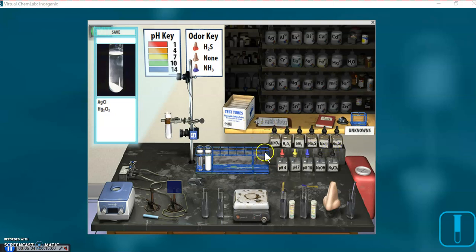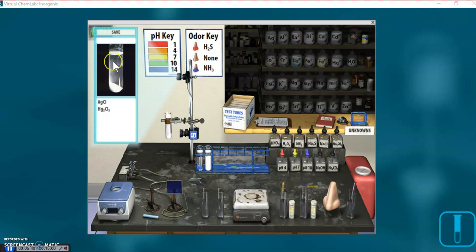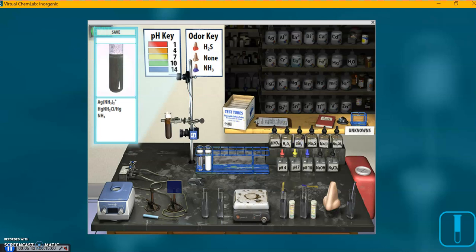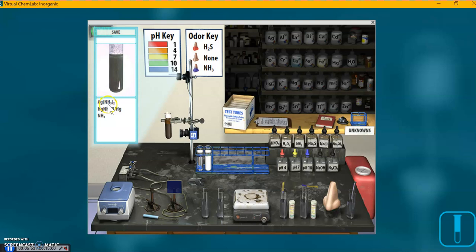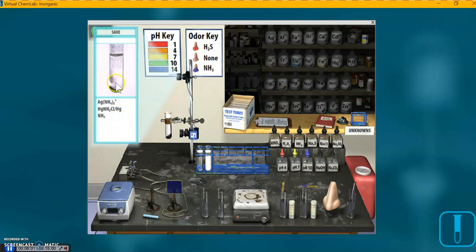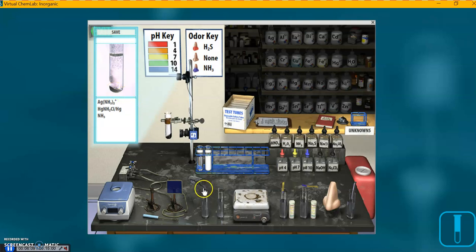Okay. We are going to turn off the heat now. Okay. I'm going to do another test now. Over on the reagent shelf, this is called the reagent shelf, this area right here. I'm going to click on NH3, ammonia. Look up here when I do that. I'm clicking now. Okay. So we have, we have a change. We've got, notice here, the silver ammonia. It's called the diamine silver complex ion. And it is soluble. I'm going to spin it. And so now we have the soluble portion of the solution up here.